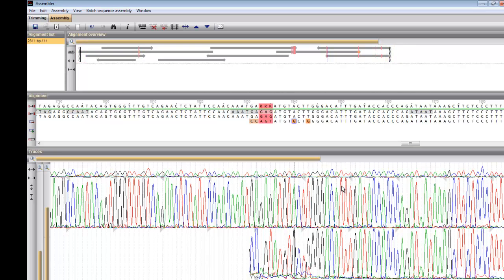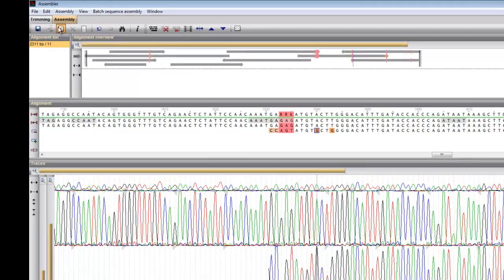All technical information on the settings used to achieve this contig project can be viewed in the assembly report.